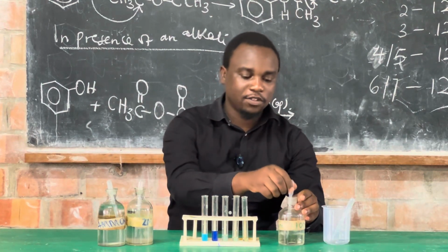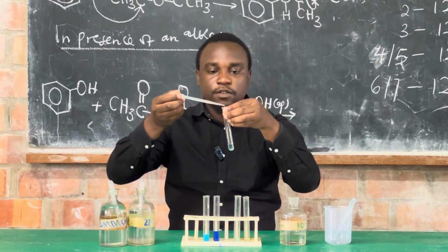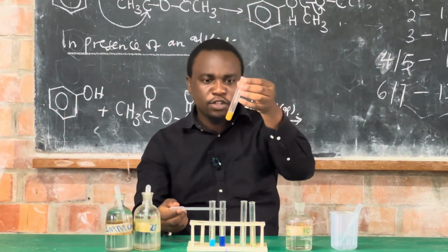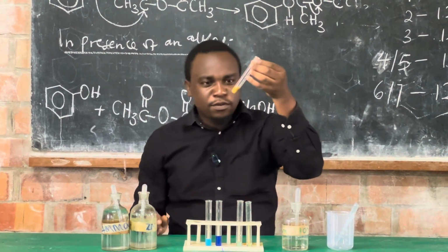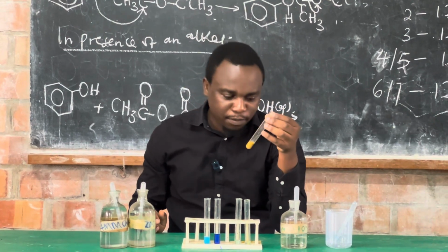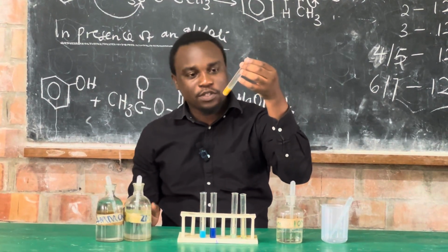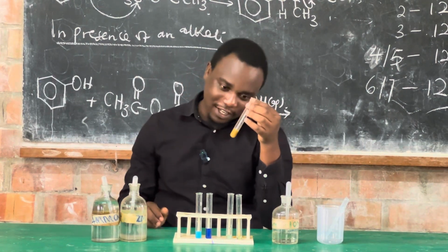So to this test tube here, I will add a few drops of potassium iodide solution. And as we can see, we have formed a brown solution. But in this brown solution, if you look keenly, there is another precipitate which is in between. So addition of potassium iodide to copper 2 ions, we observe a brown solution, or you can say a dirty white precipitate which is formed. However, like I have told you, there is another precipitate inside here.